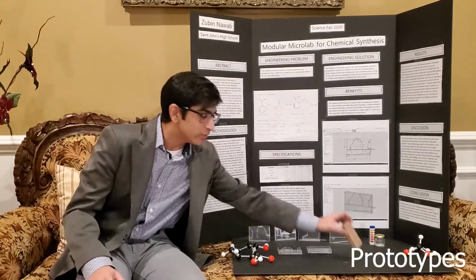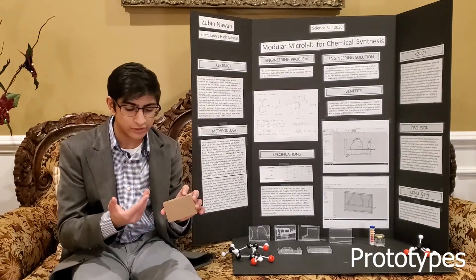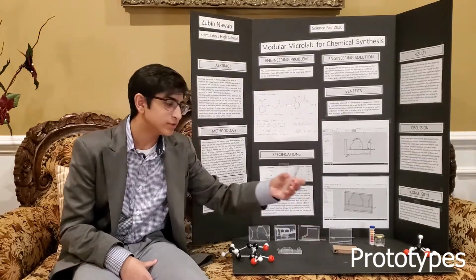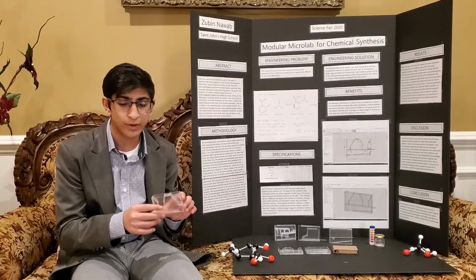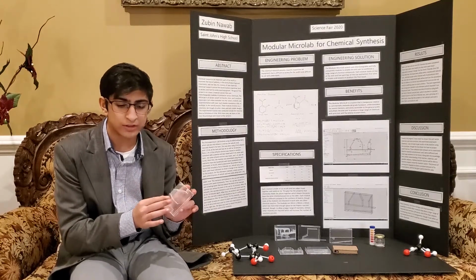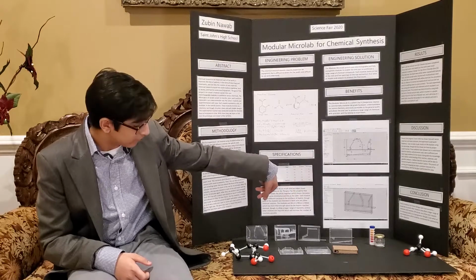So over here you can see this is the cardboard model, the first one I made. It's just to determine the size. I wanted to see exactly how it would feel in the hand. I next moved on to this hot glue model. It's now made of acrylic. So over here, this is the final one. This one used weld-on. Weld-on is much better because it chemically fuses the acrylic pieces together, just like a weld glue. So yeah, these are the 4 different types of modules I have.